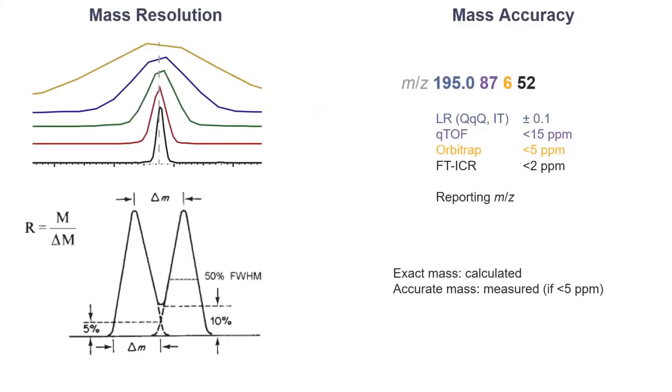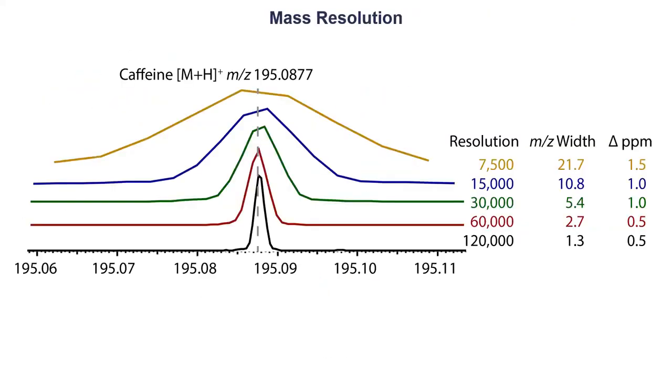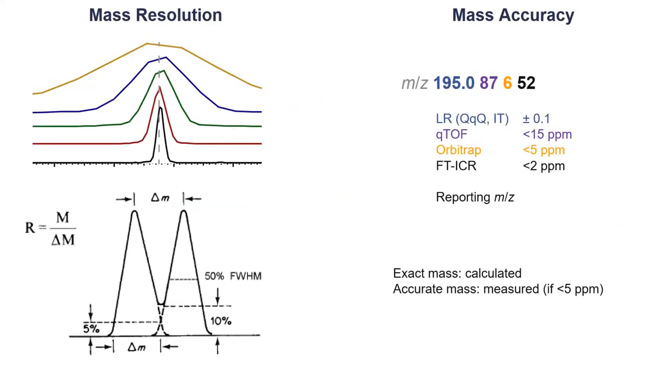And something else I also want to highlight in combination with the mass resolution: if you write a paper about it, how do you actually want to give the number, or how accurate is your number? This is something I really want to highlight. Even though your mass spectrometer says, oh, I have this number of digits acquired, is it really true? If you have low resolution, you can't just use any digits that the system is giving. So you should be aware that your accuracy is not that high.